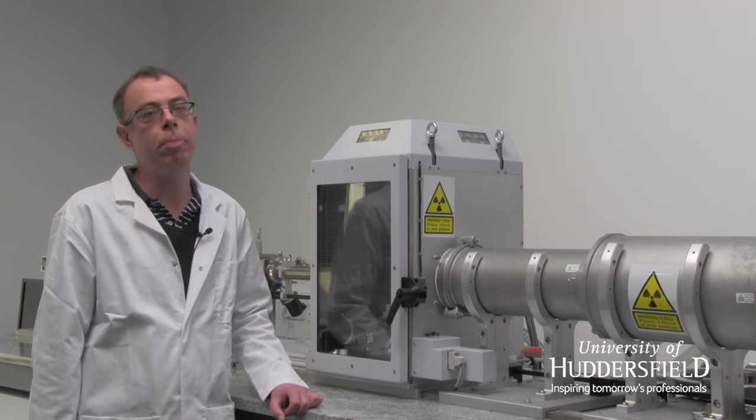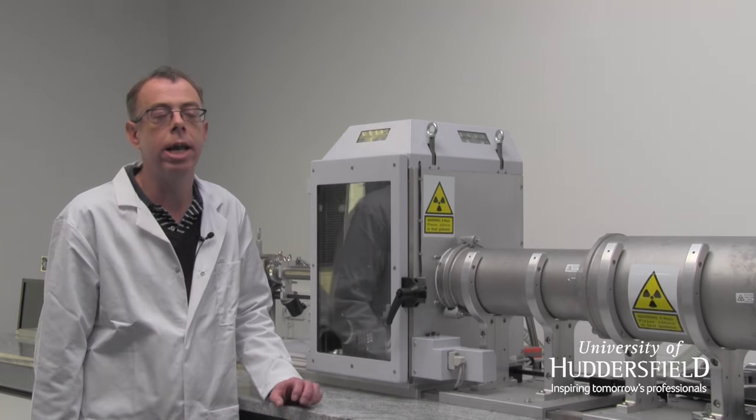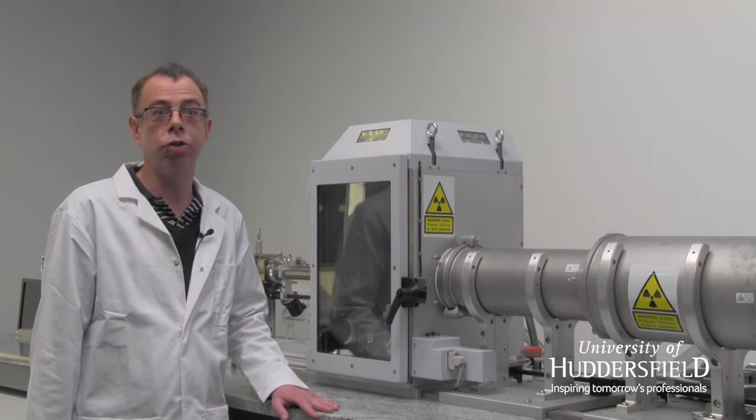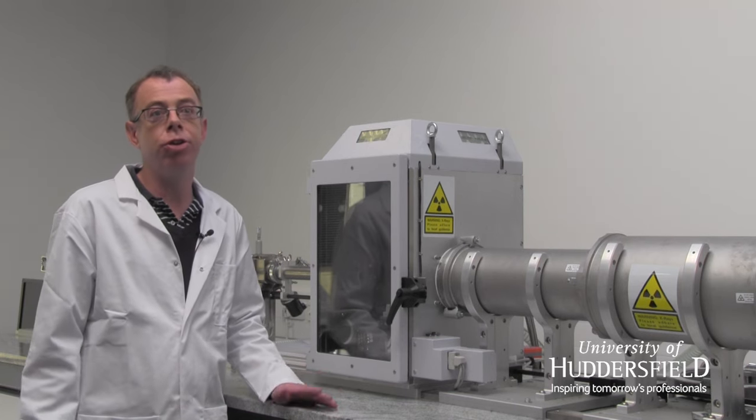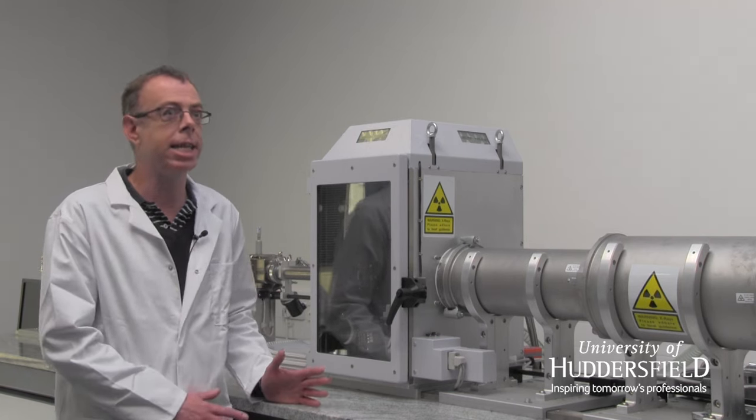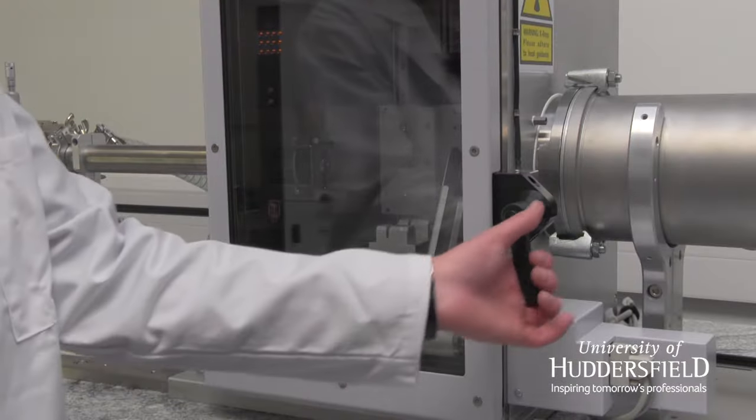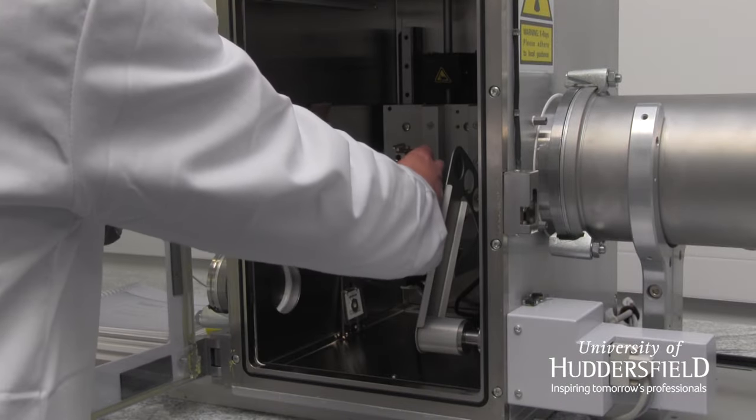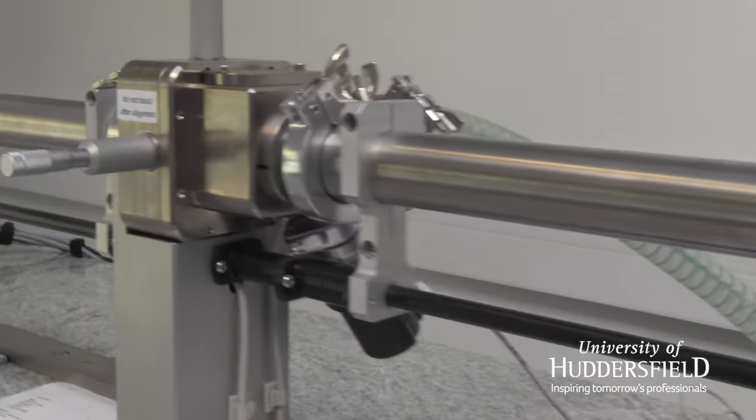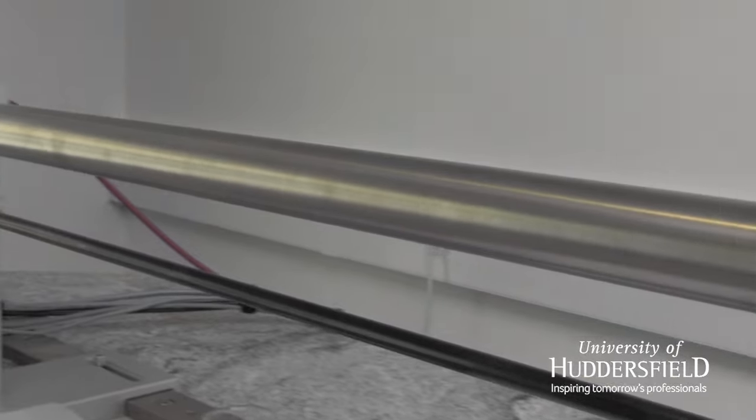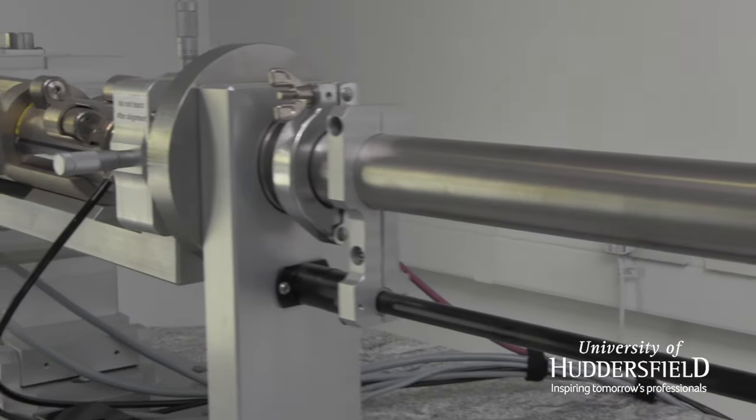This is a unique and very expensive machine, the small angle X-ray. Just like all the other instruments, it measures diffraction of X-rays. But you're looking now not just molecular order, how your atoms are arranged, but how your molecules are arranged over a long range rather than a very small range. So you can look at materials over a bigger area.